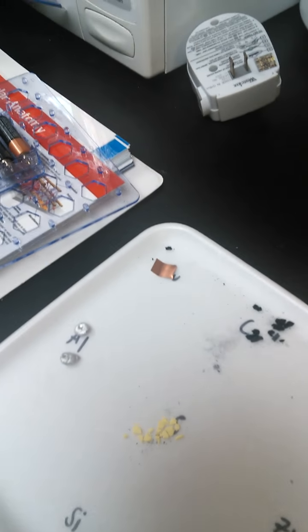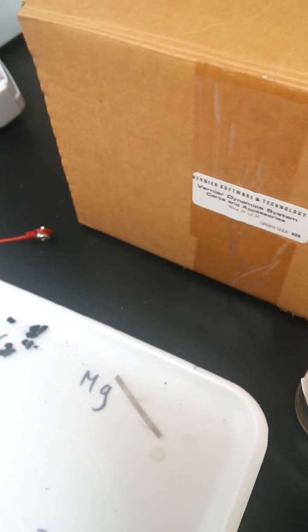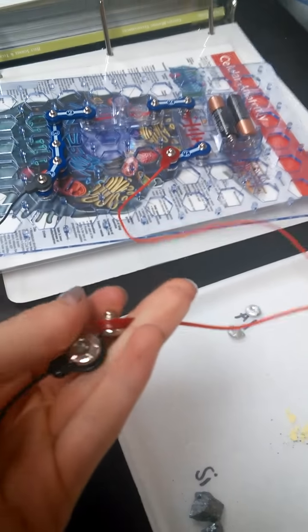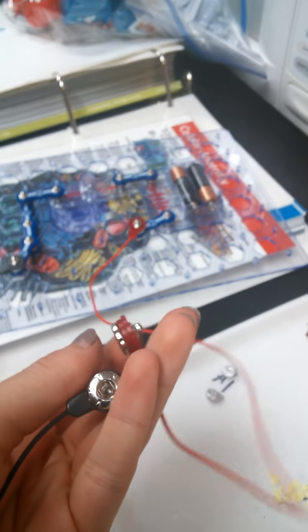conductivity test. So I have a short circuit right here, and we're going to use each of the elements to see if it can conduct electricity. So if I were to tap these two ends of the circuit together, that light bulb would turn on. So if we place an element between these two ends, we can see if it will conduct electricity.